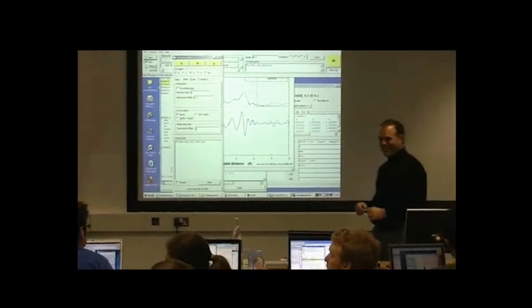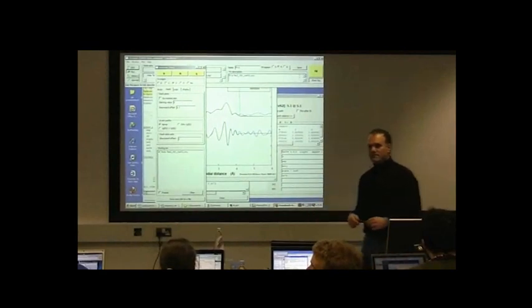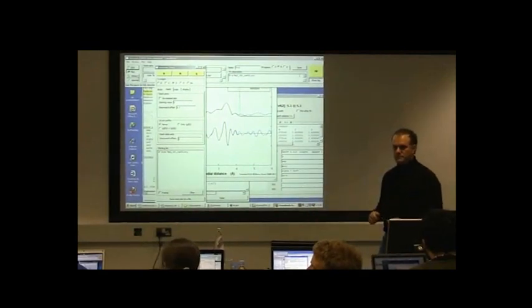S0 squared, S whatever it is squared. Yep. That, if I've got this right, that's a property of the absorbing atom. Yes. So should that then not be the same? I mainly work with palladium, so should that be essentially the same for everything I ever do where palladium is my absorber?